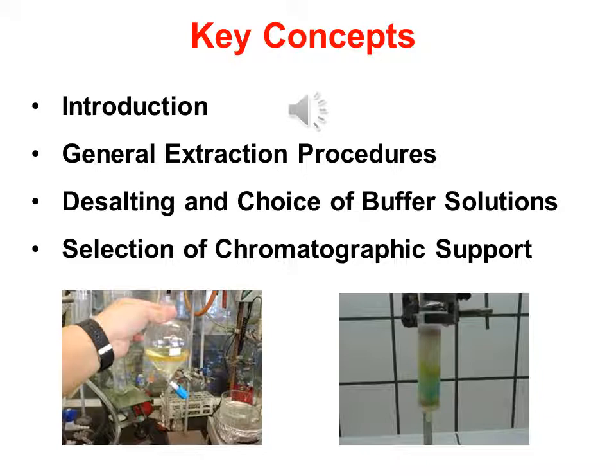Isolation of compounds in pure state from natural sources is the most important, yet can be difficult and time-consuming step in natural product research. It begins with the process of extraction followed by various separation techniques. One such separation technique is the solvent partitioning method, which usually involves the use of two immiscible solvents in a separating funnel.